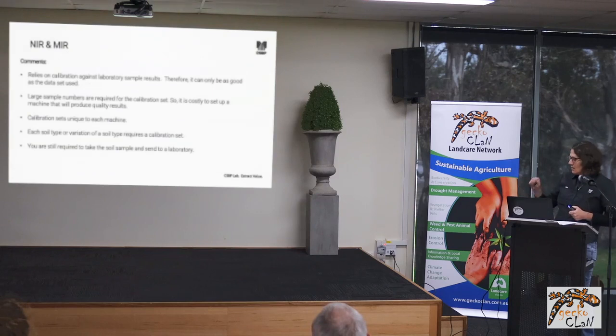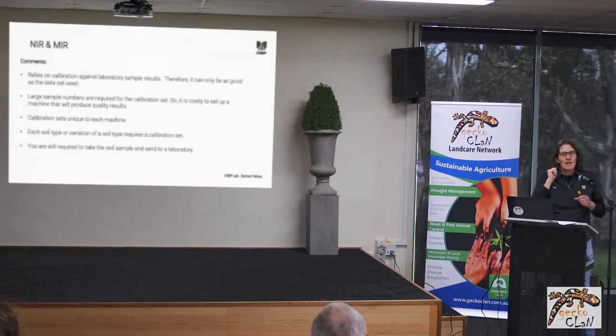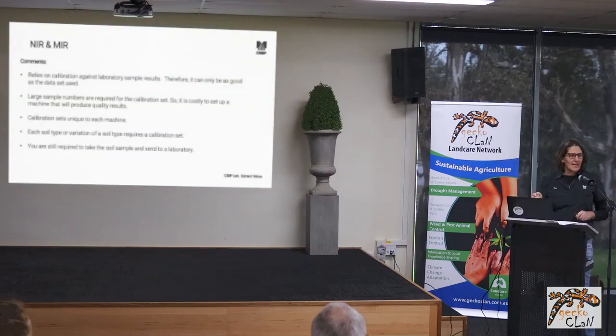Another thing, CSBP Fertilisers have got a NIR device, which is analysing your nitrogen, and now it's been calibrated for potassium in your crops, so your cereals and your canola. Now they've had this device since I started, so 5 years it's been there. They've done thousands and thousands of samples of scanning the plant in the paddock, taking the plant to the lab, analysing it and seeing if the scan matches the result in the lab. Thousands of samples. So it takes a long time to get a calibration set.